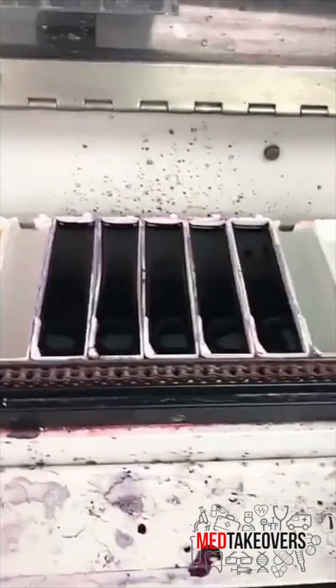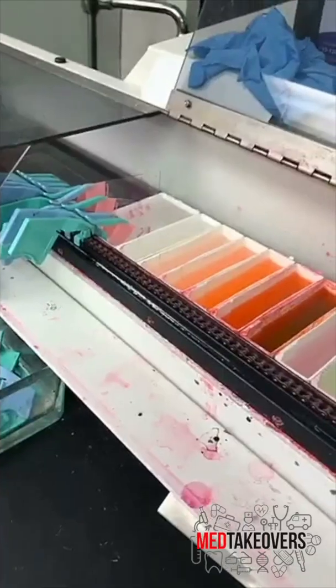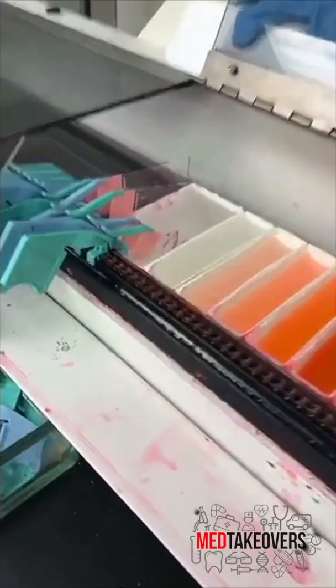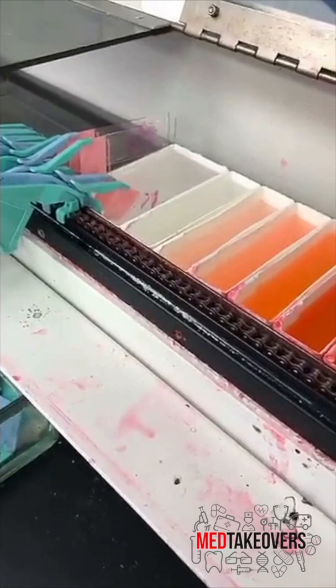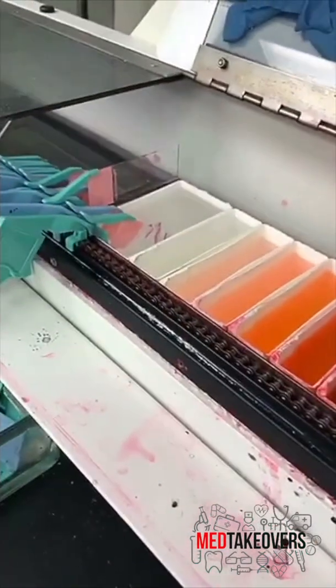Then the slides bake in an oven and go through a series of chemicals called hematoxylin and eosin to make the slides stained. You can do this staining by hand, but we have an automated stainer that does it for us. At the end, you can see that we've gone from clear tissue to tissue that's pink and blue.